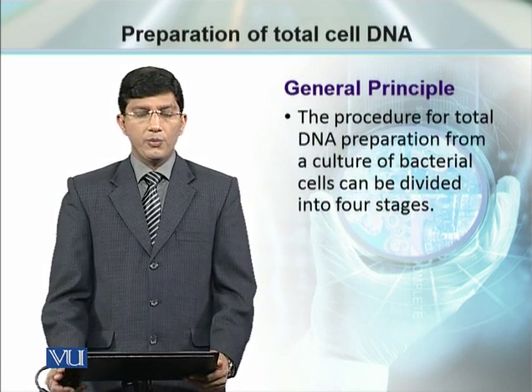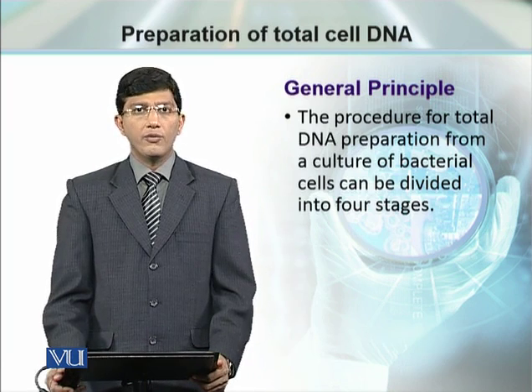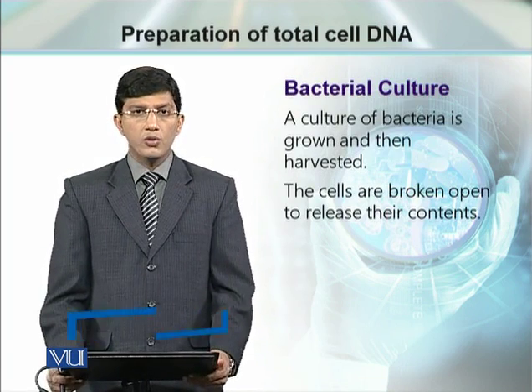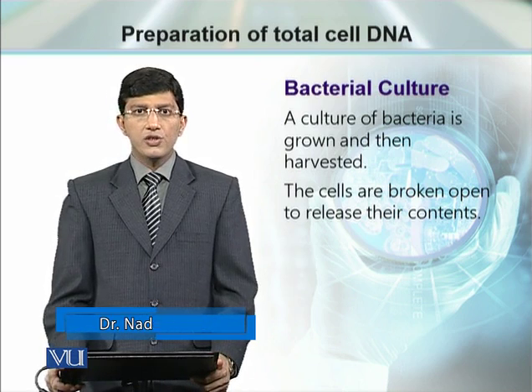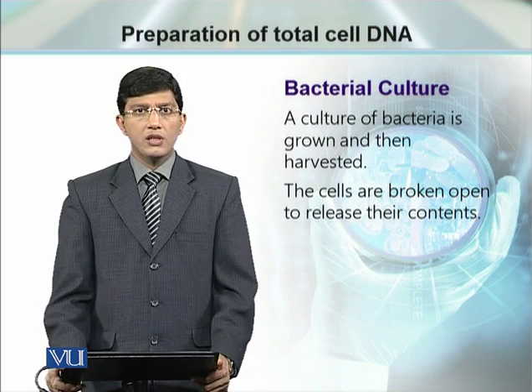As a general principle, using a bacterial cell to isolate the DNA, we have to go with 4 different steps. The first step is going to be the bacterial culture. Once you establish the culture using the defined or complex culture media, then the density of the bacteria reaches a certain level.